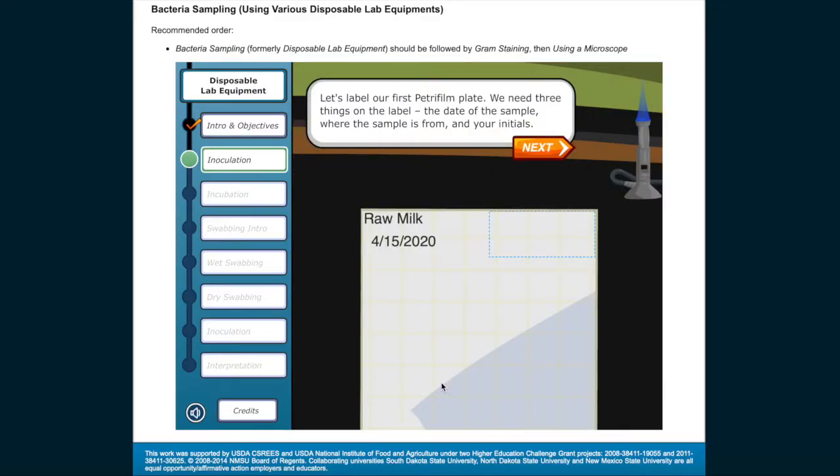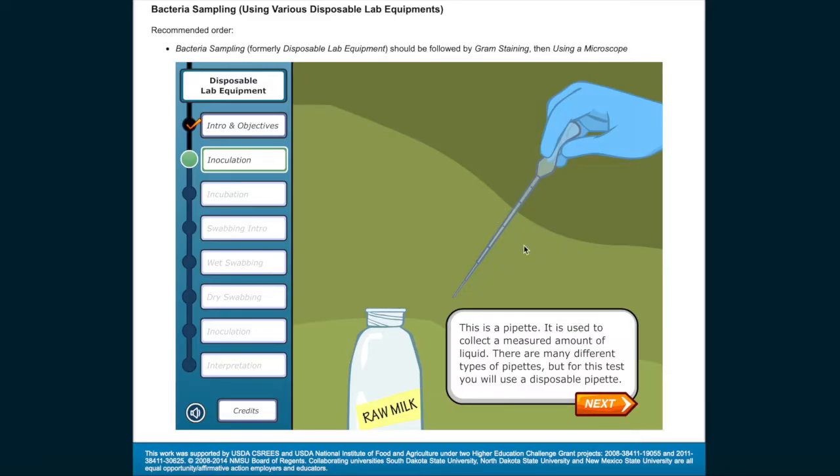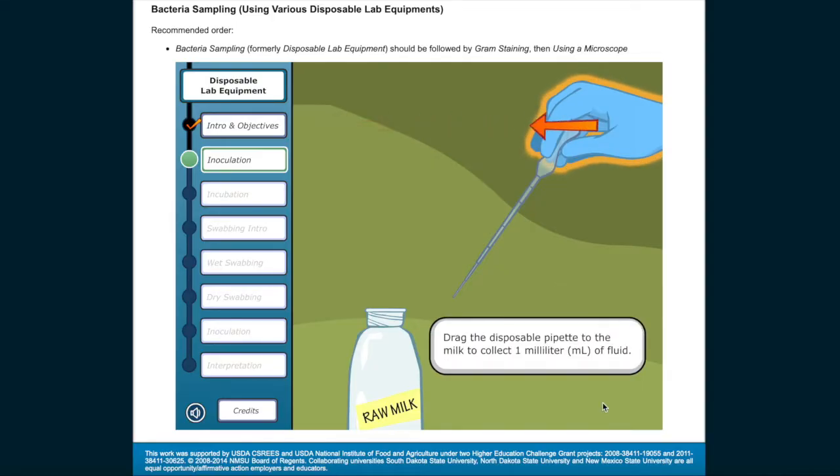Let's label our first Petri film plate. We need three things on the label: the date of the sample, where the sample is from, and your initials. Go ahead and write your initials in the blank area provided for labeling. This is a pipette — it is used to collect a measured amount of liquid. There are many different types of pipettes, but for this test you will use a disposable pipette. Drag the disposable pipette to the milk to collect one milliliter of fluid.